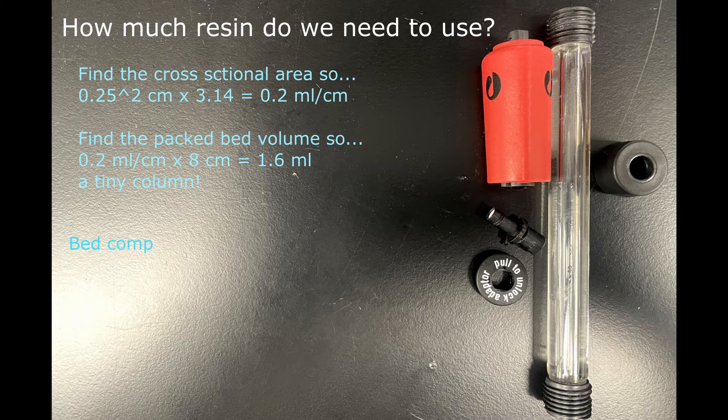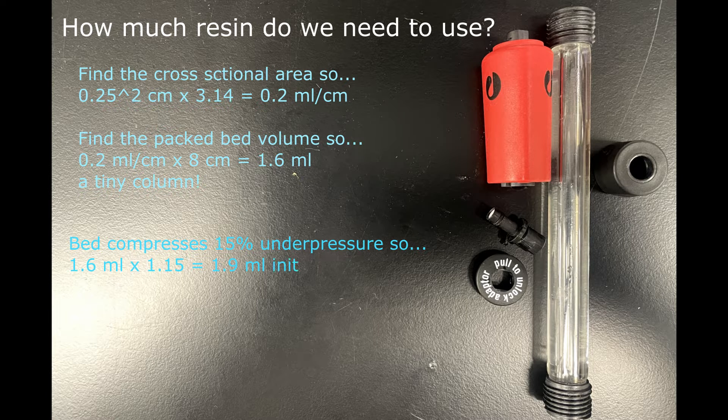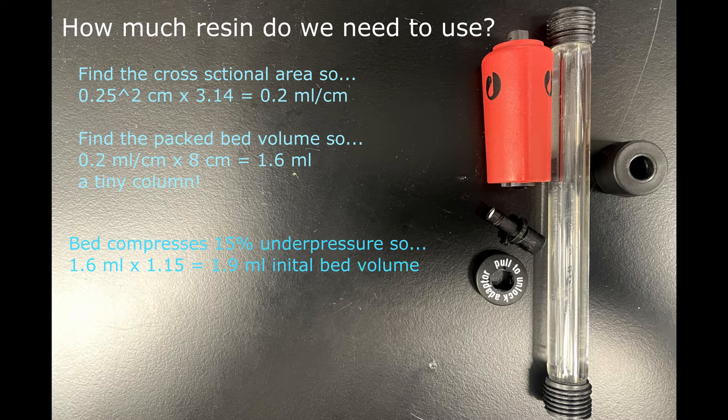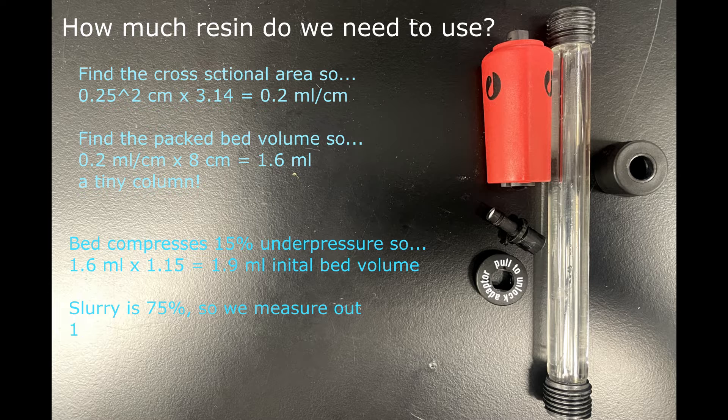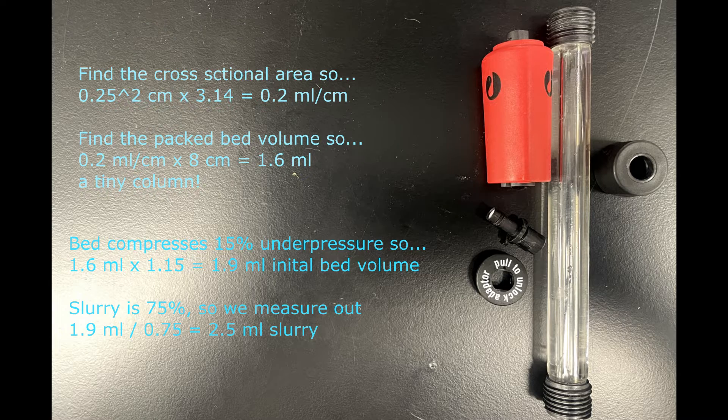Now it's a guess, but the bed tends to compress about 15% under pressure, so we're going to multiply 1.6 times 1.15, which will give us an initial unpacked bed volume of 1.9 mils. Since the slurry is a 75% slurry, we're gonna divide 1.9 by 0.75, which means we need to measure out about 2.5 mils of slurry.